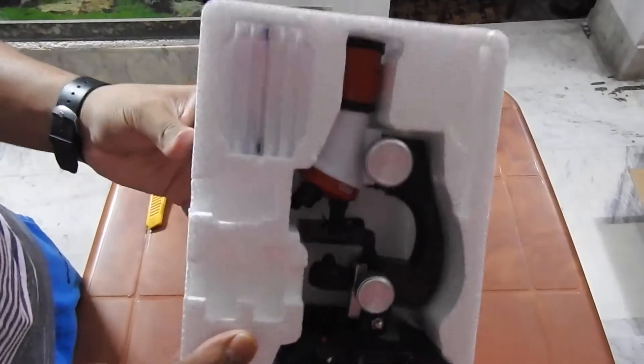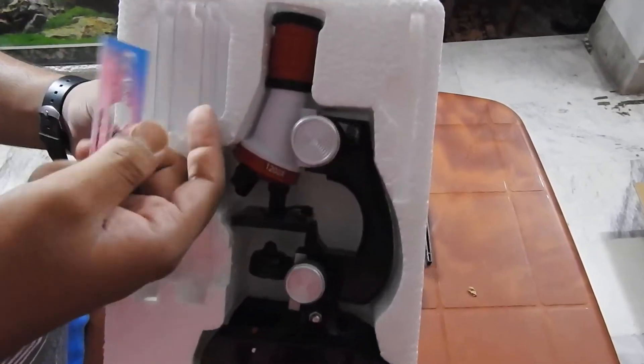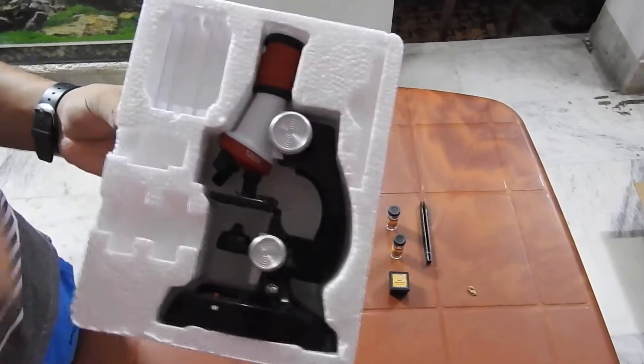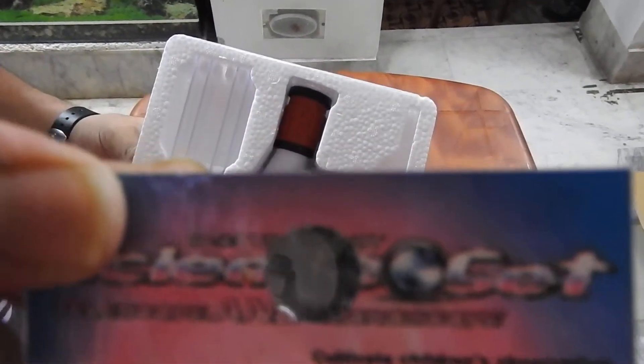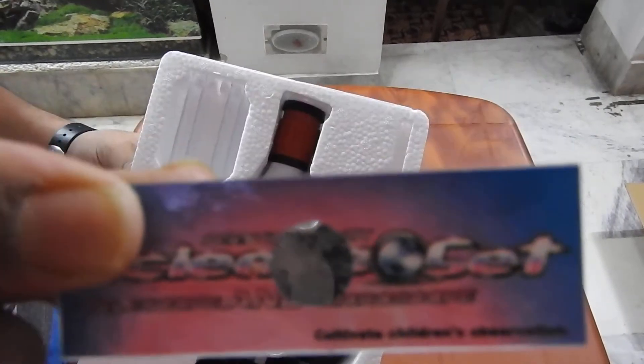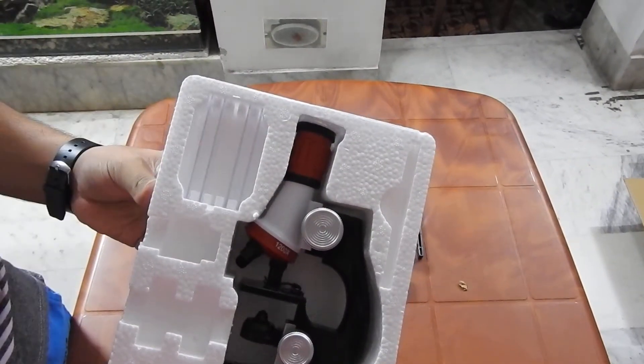You can see now over here are some slides, and among them these four slides are all plastic so they'll never break and you can use them unless you scratch too much. Now this is a prepared slide, I'm bringing it close. Can you see something, some hair-like things? I'm sure you can see it. It is a prepared slide, I don't really know - it looks like hair or something, tiny little yellow kind of straws or something. So those are slides.